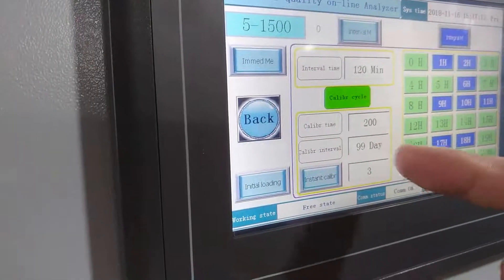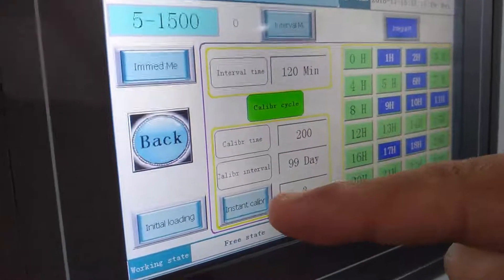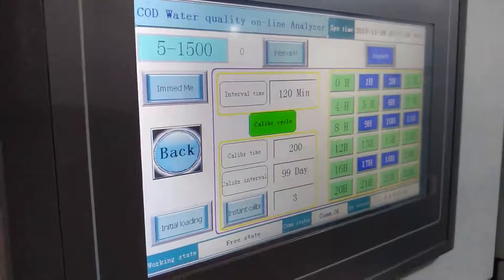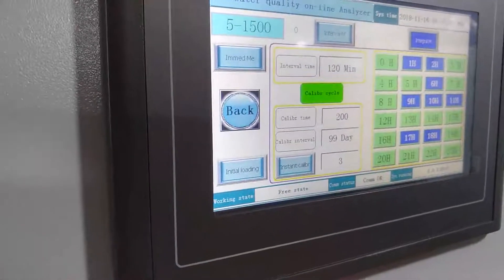After all settings, press the instant calibration button. It will start calibration. The calibration will usually keep one hour and 50 minutes.